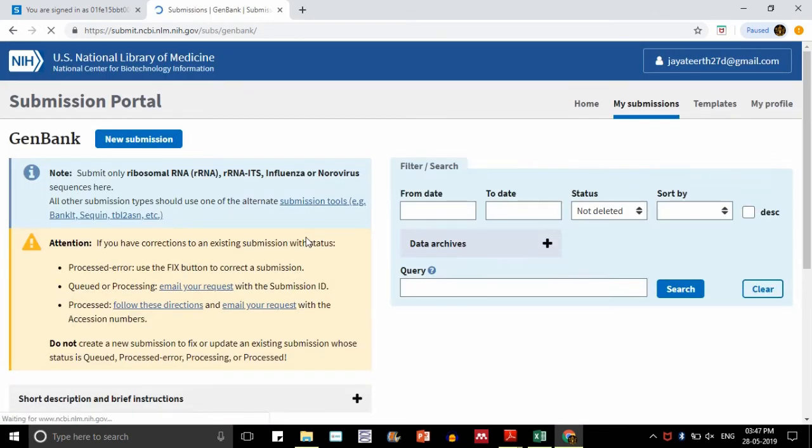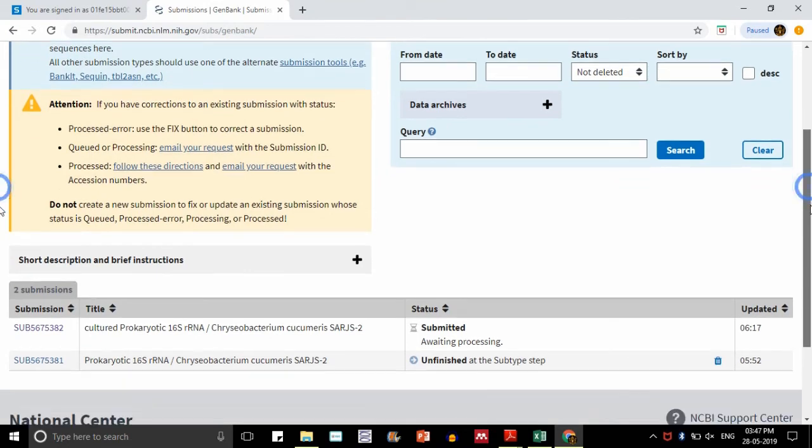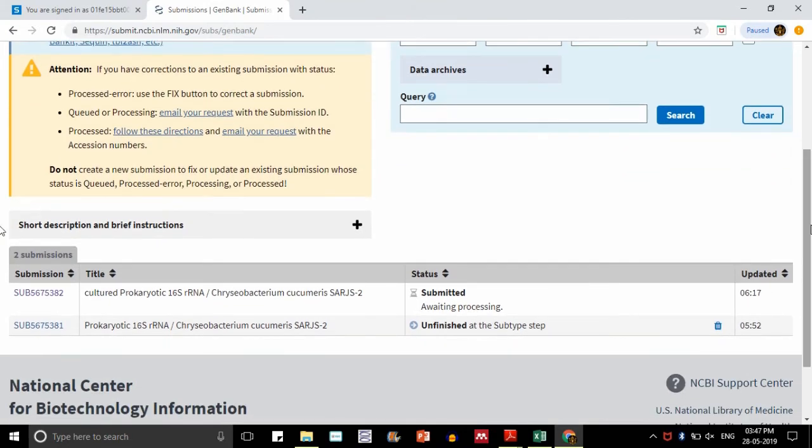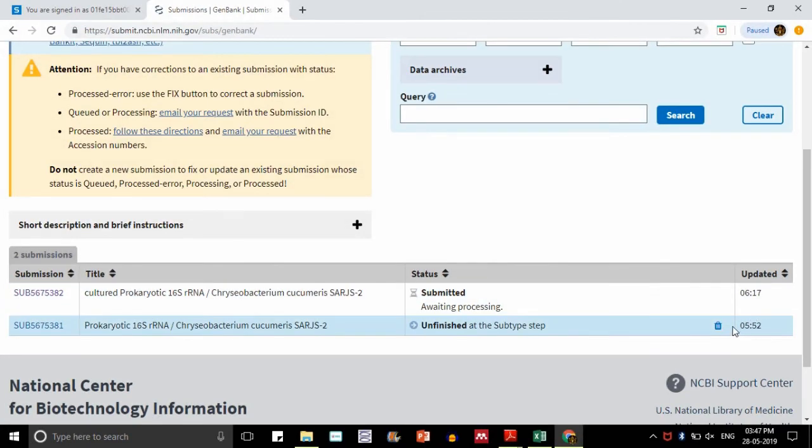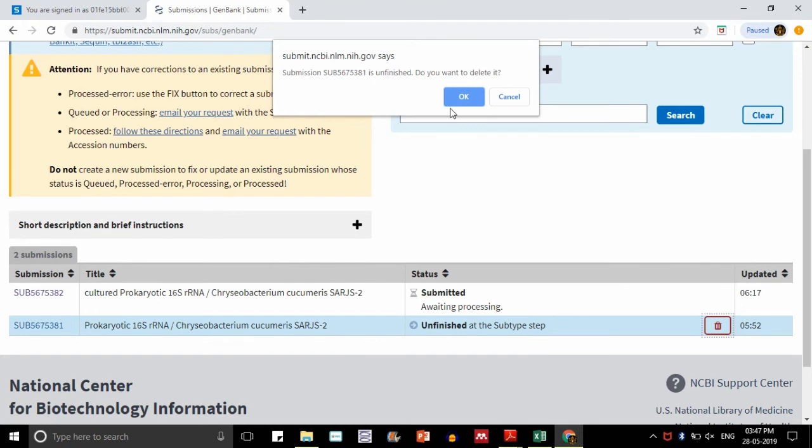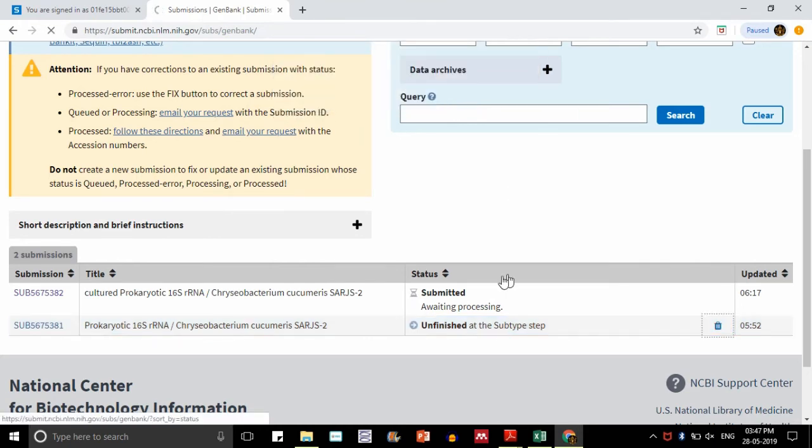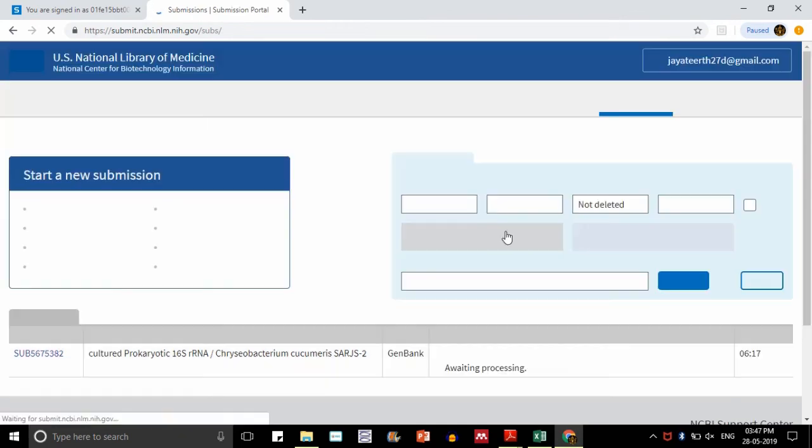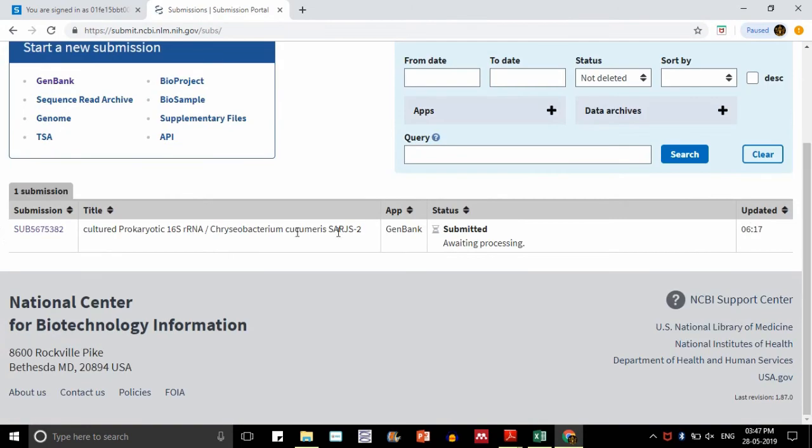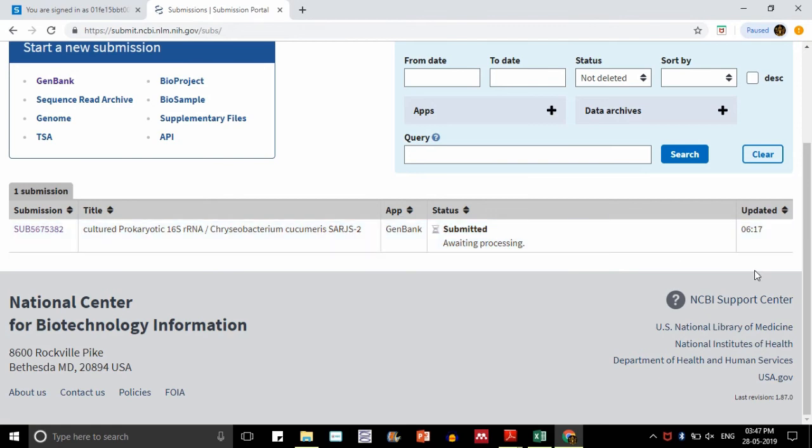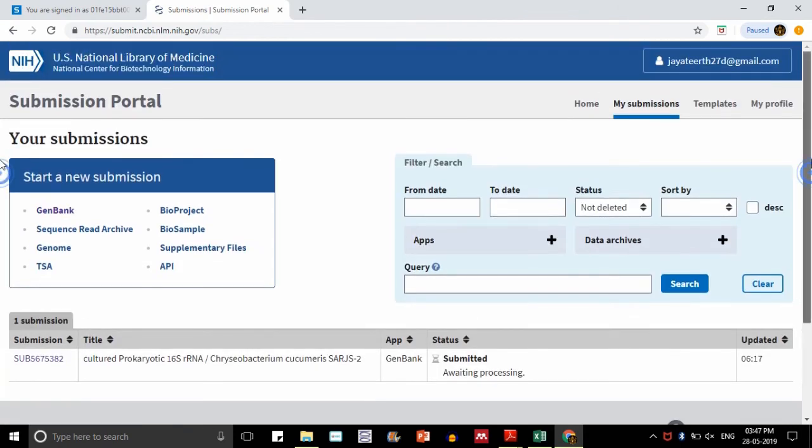Here you have submitted completely. Now it is submitted and awaiting processing. You need to know one more thing here: you should always have been logged in. If you have not logged in, you cannot submit. I am just logging out.